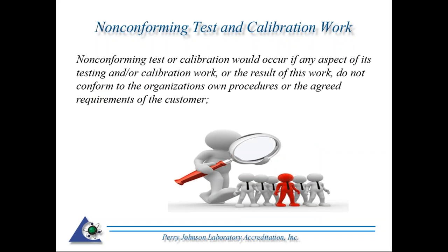So going right into today's topic, nonconforming test and calibration work, what is it? Nonconforming test or calibration would occur if any aspects of the organization's testing or calibration work or the results of work do not conform to the organization's own procedures or the agreed requirements of the customer.